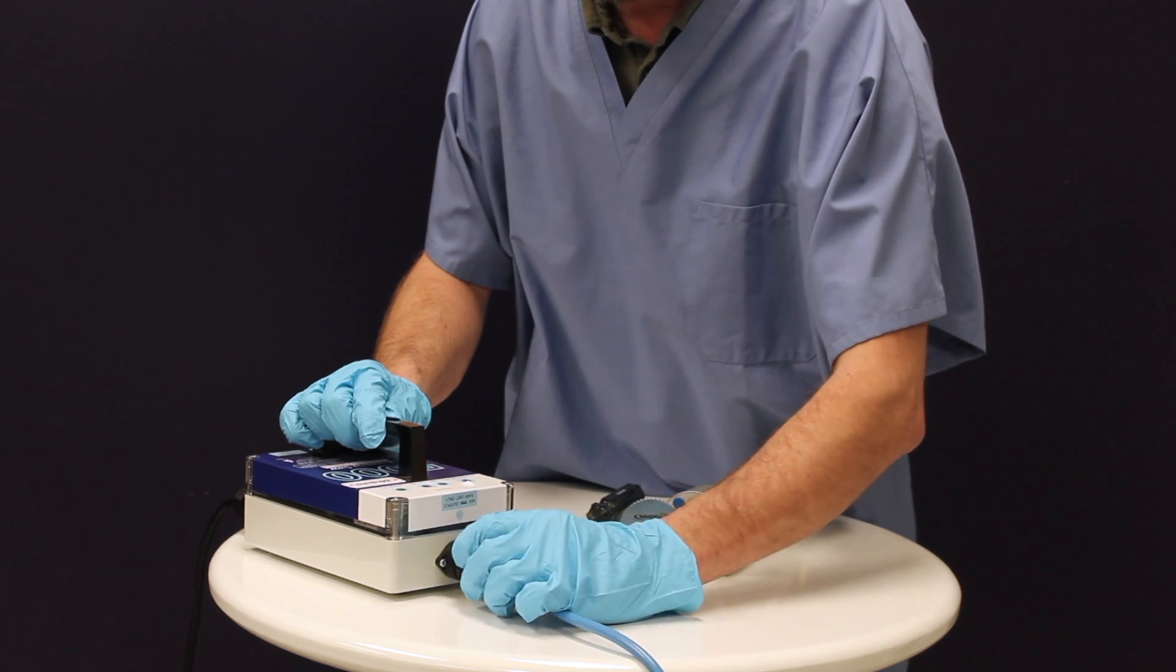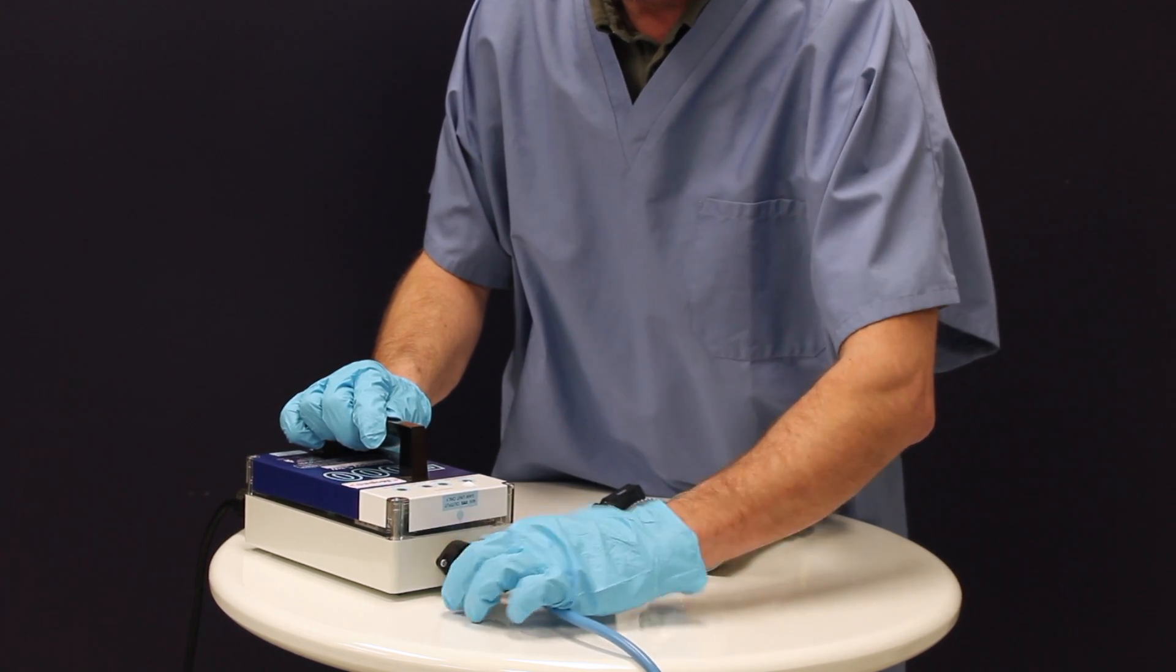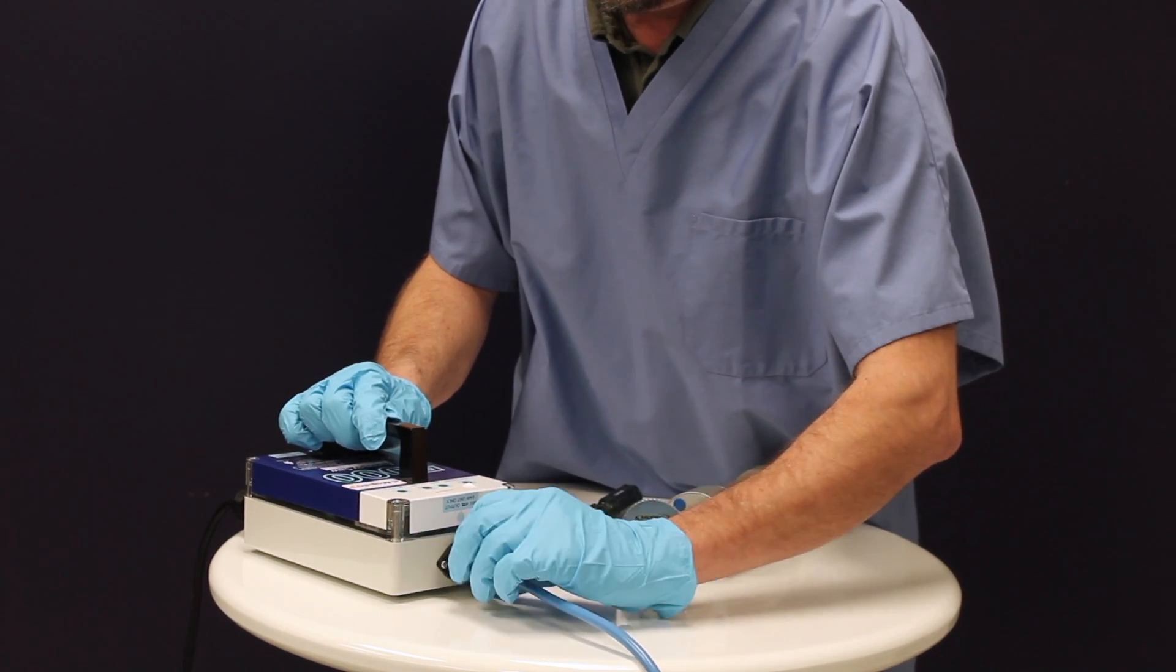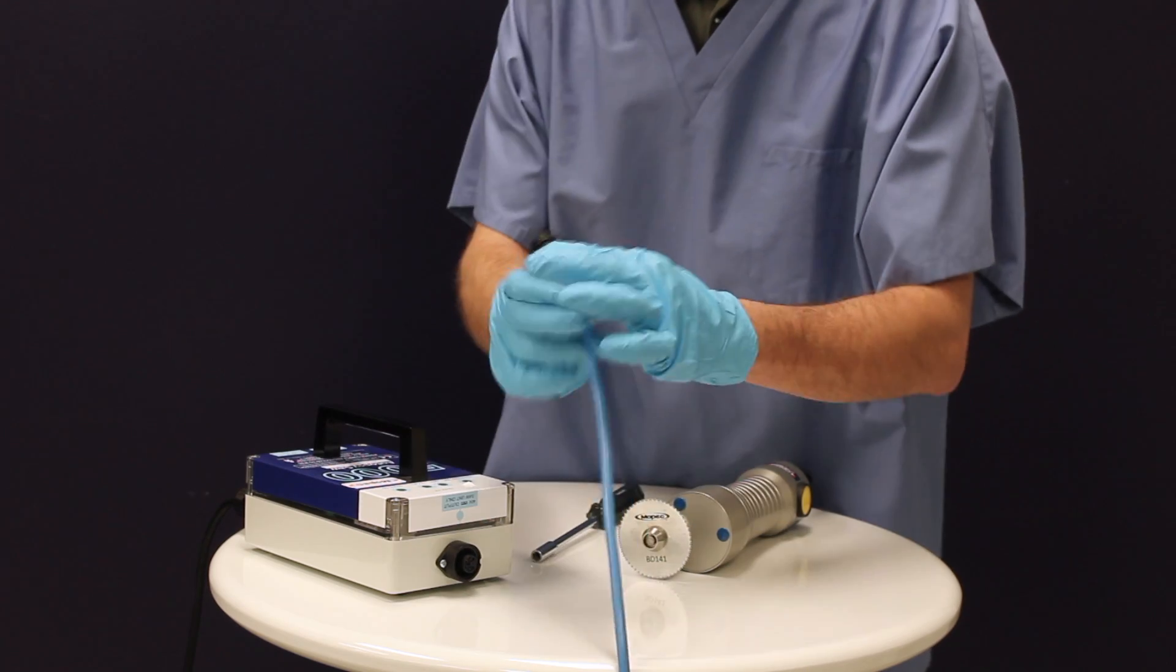When troubleshooting or changing the blades on your autopsy saw, make sure your power source is powered off. If you need to disconnect from the power source, remove the cord by twisting counter clockwise.